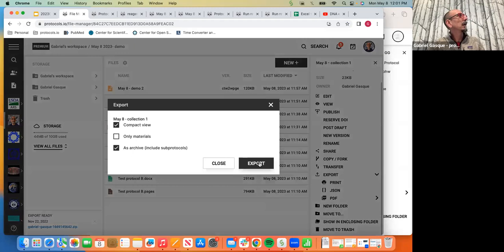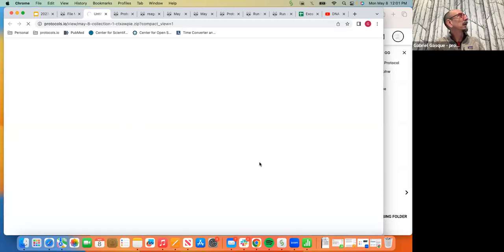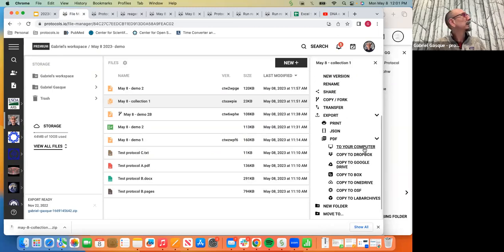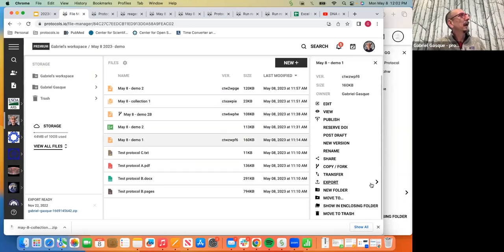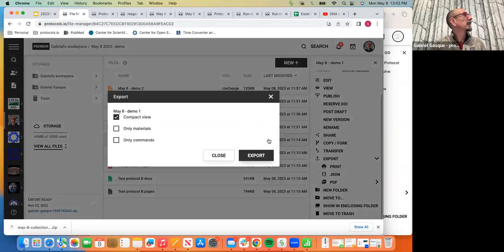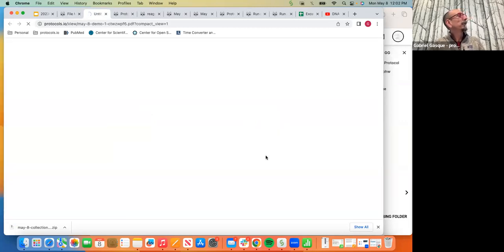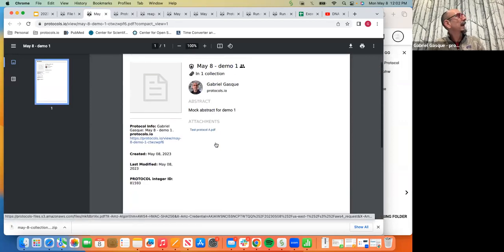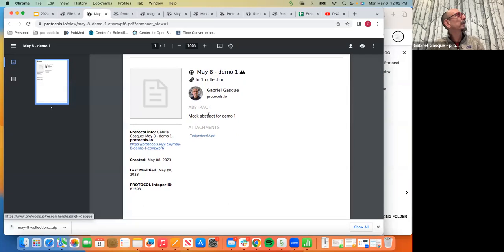No, that's not what I wanted. Export. Sorry, let me take this one. Export PDF and to the computer. Okay. So I'm exporting it as a PDF. And, oh, because this is the collection.